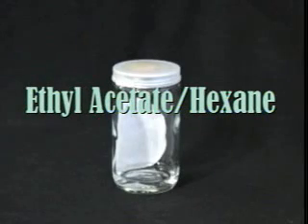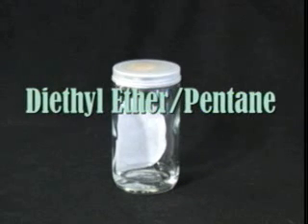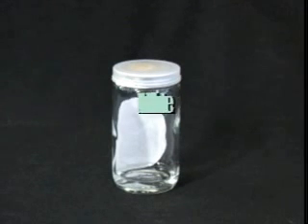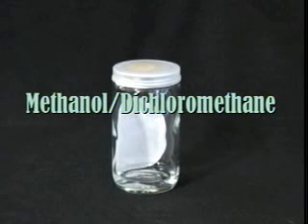Most commonly, you will use a solvent system composed of a mixture of ethyl acetate and hexane. But when you are purifying a volatile compound, it is a good idea to use a lower boiling solvent system, such as a mixture of ether and pentane. Mixtures of methanol and dichloromethane are frequently used to purify highly polar compounds.